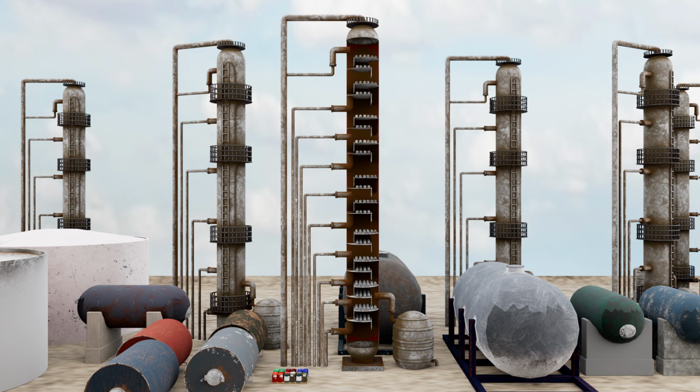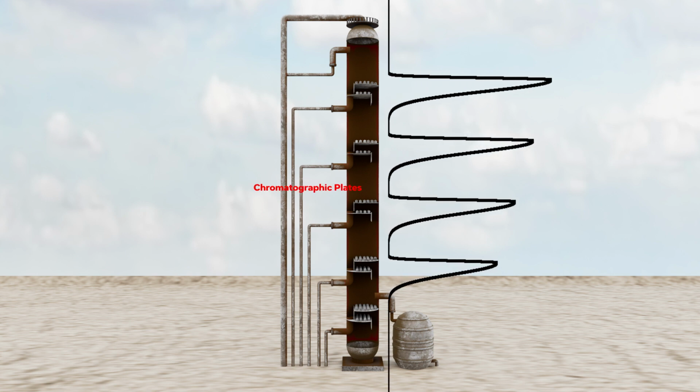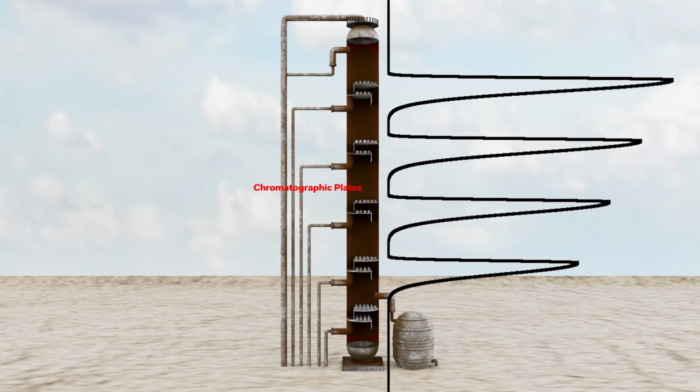This is a continuous process. Crude oil is heated, distilled, and collected. An easy way to illustrate this process is to use a graph to show the buildup of each crude oil fraction as it is collected. This demonstrates the basis for the theoretical separation of components in chromatography, or chromatographic peak resolution.